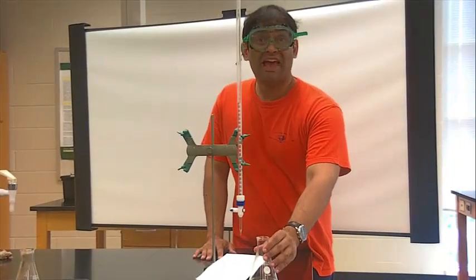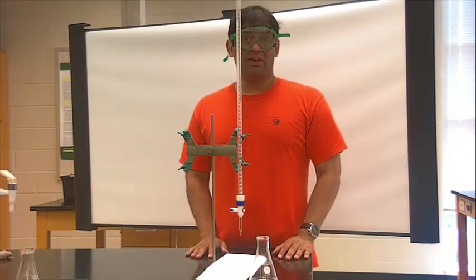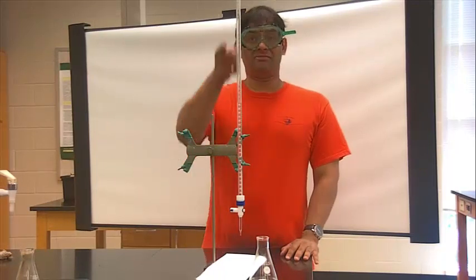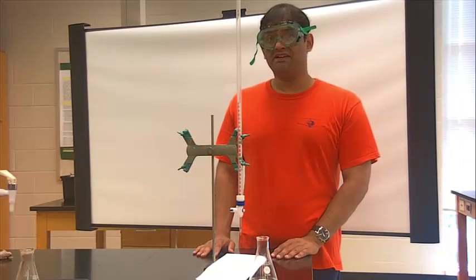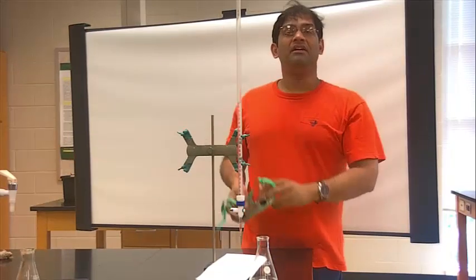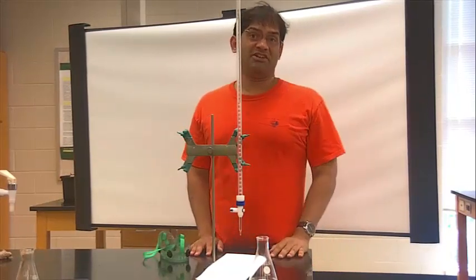You want to report your exact titration. Your exact titration is the number that you were very focused and very careful on getting in terms of the equivalence point. So record your exact titration for the 40 mil filtrate. Record your exact titration number for the 80 mil filtrate. And that will constitute 4 titrations.